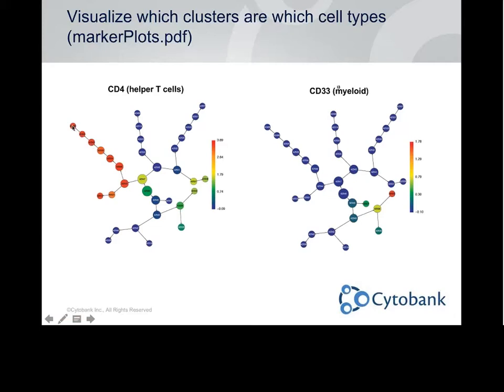These events right here are contained in this node, and all the events in this node are contained in this node. And it goes all the way back up. It might be tough to see from your computer screen, but these are actually arrows instead of just straight lines connecting these nodes. If you follow them back, they point you to the originator node, and this is where all of the events are contained.